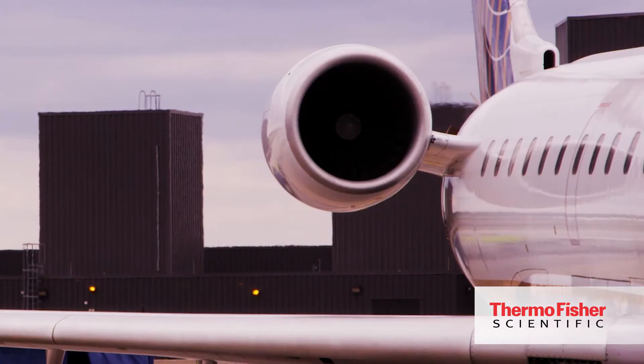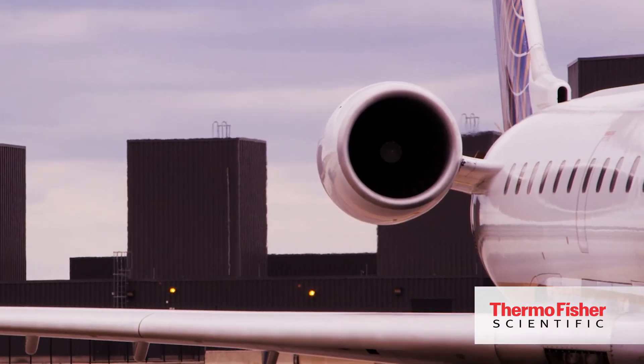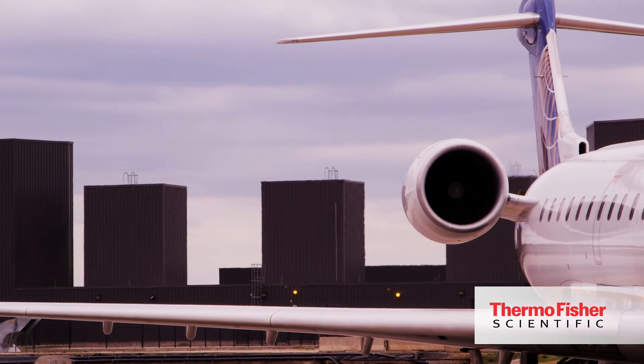This is very often used for a variety of different alloys. For metals, traditionally it's a piece of a nickel alloy used for the aerospace industry — for jet engines and rocket engines. So special materials with dedicated compositions.